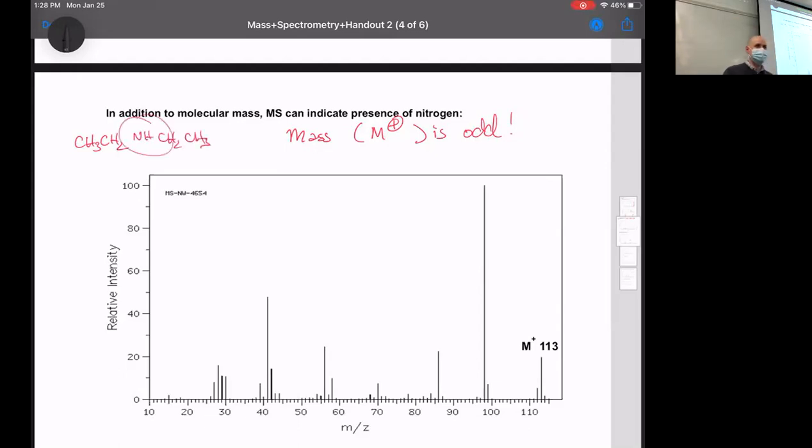But if you stuck a nitrogen somewhere in your molecule, nitrogen makes 3 bonds, so it'll bring an extra hydrogen, and it'll always make your number of hydrogens odd, which means that your molecule as a whole will have an odd mass. Whether or not you remember anything I said in the last 45 seconds, odd mass indicates a nitrogen.